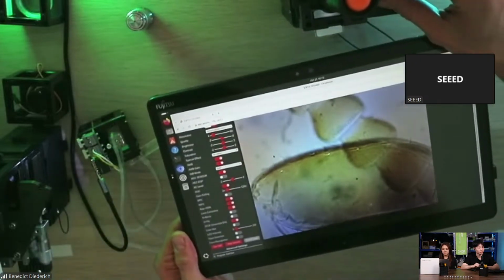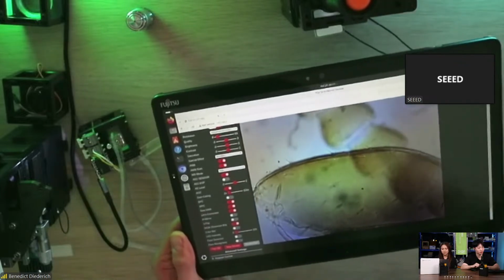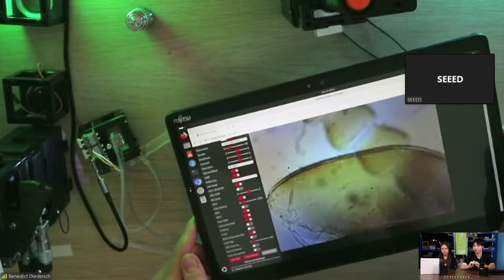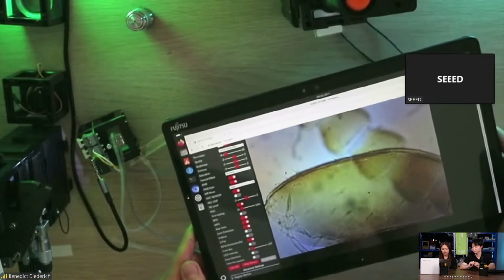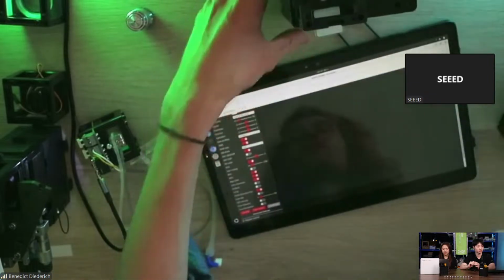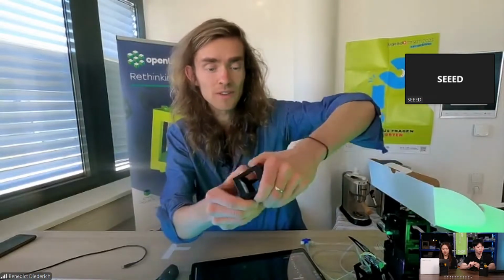This is the most simple part. And the coolest thing is you can just take this entire thing into the environment and then play with this. And something that you cannot do with the typical USB microscopes so easily is, for example, open this cube thing here. So I'm just showing that here now. You have this cube, you just unpack it here. You can actually open that thing. Maybe first remove the slide because it's glass.